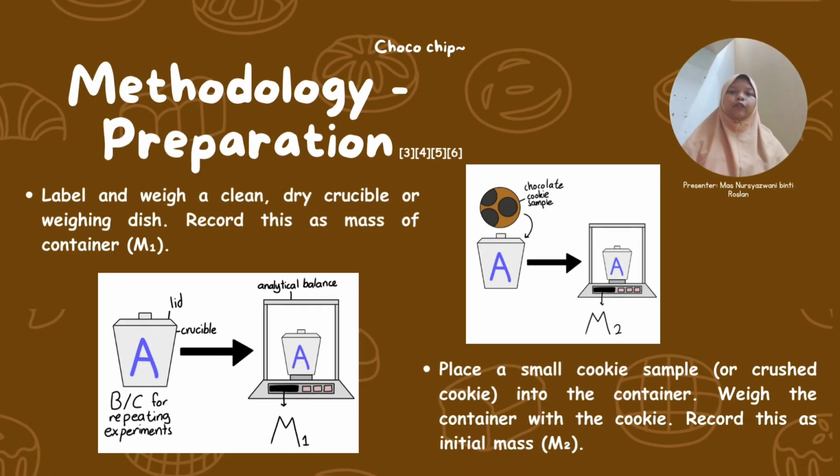Here in this slide, I will begin talking about the more important parts of the methodology, which is to say the experimentation part. It will be divided into 3 sections. First of all, we are going to be talking about the preparation steps. Now, these preparation steps are important to make sure the experimentation goes smoothly.